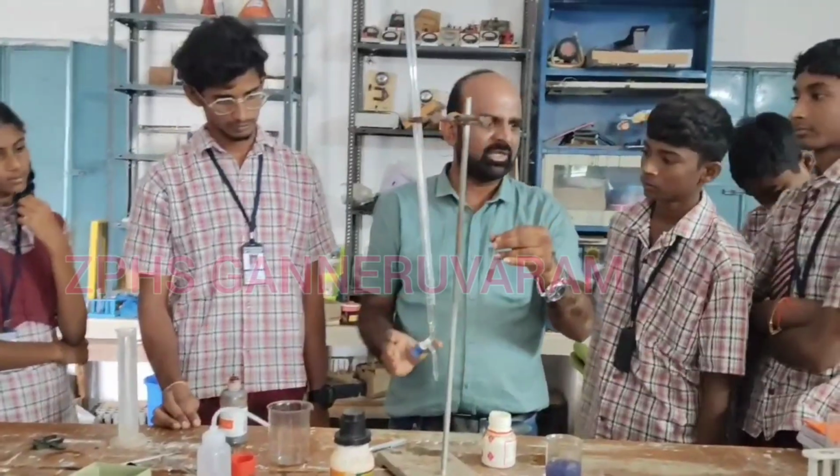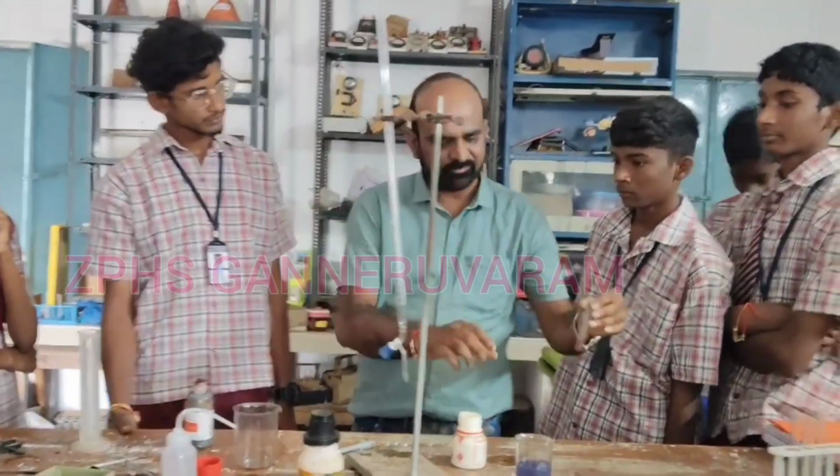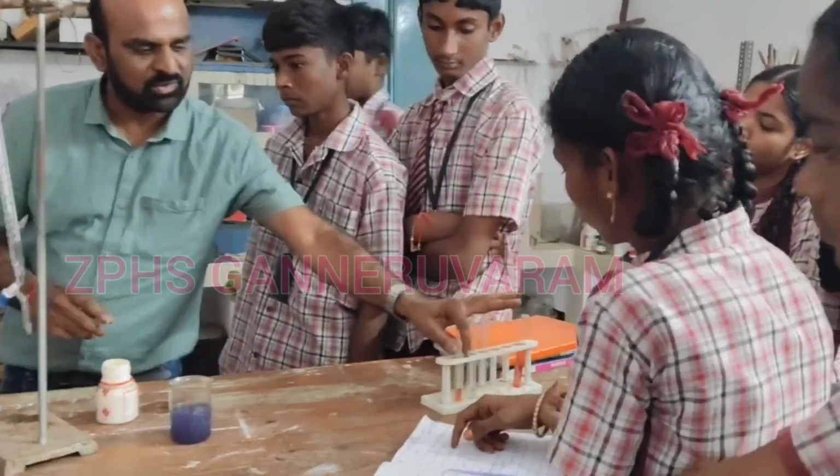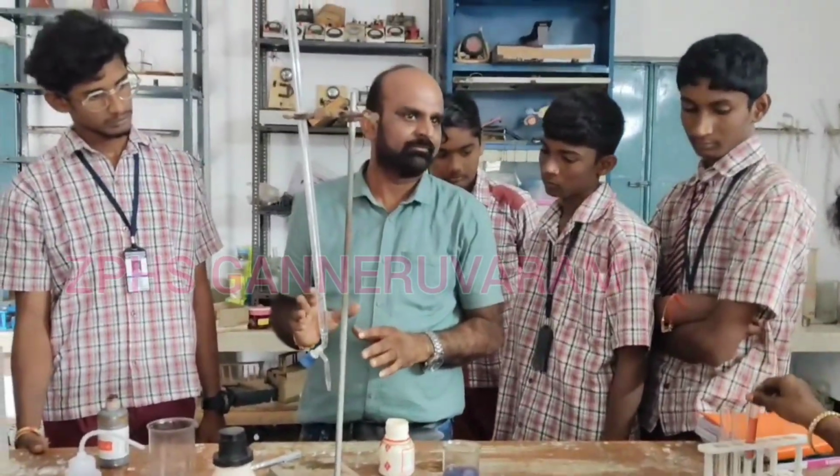If you take the phenolphthalein indicator in sodium hydroxide solution, it turns to pink color.